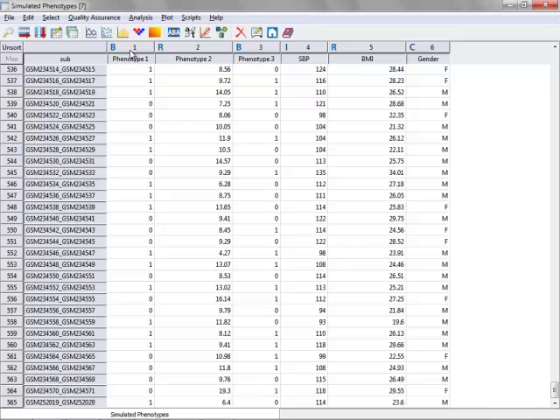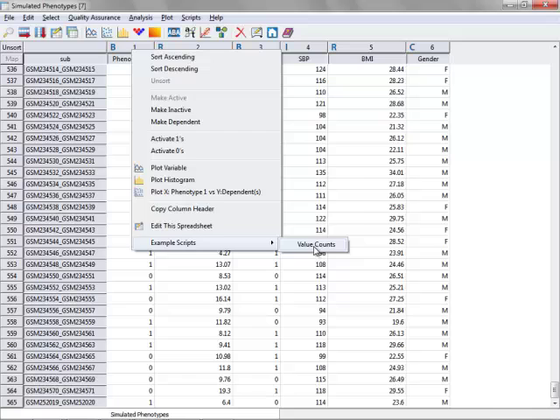If you right-click on this column, you can see by choosing example scripts, value counts, that there are 282 cases in this dataset and 283 controls.